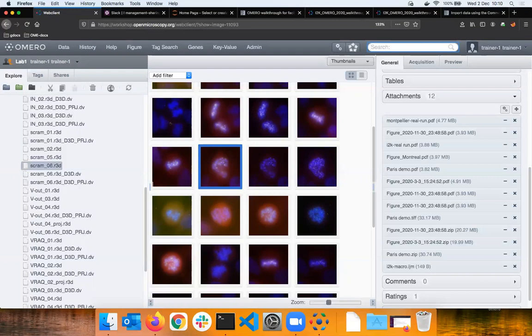When we were showing the in-place import, the data are usually in a file sharing system, maybe a Samba share, in your institution, and the data do not physically move. Wherever OMERO is running, the data don't move from the initial location where they were put post-acquisition. There is just a link between the two, so OMERO will require less storage. You will still need some space for running the Postgres database and various other things, but not the storage needed to store the images.